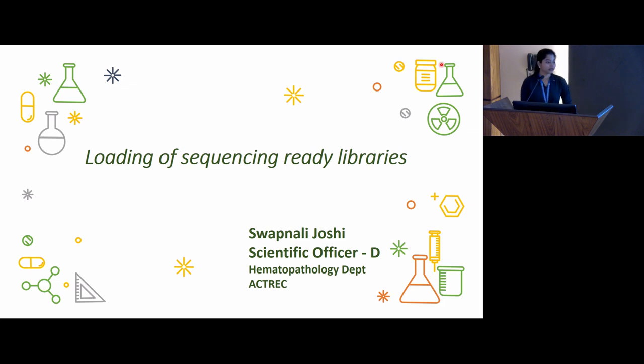Nikhil sir, I just have one question. In this qPCR method, the standards that we use, are they in-house prepared, like plasmids, or what are the standards that are used? If you use the kit that is provided by the company, then you need to use those kit standards.